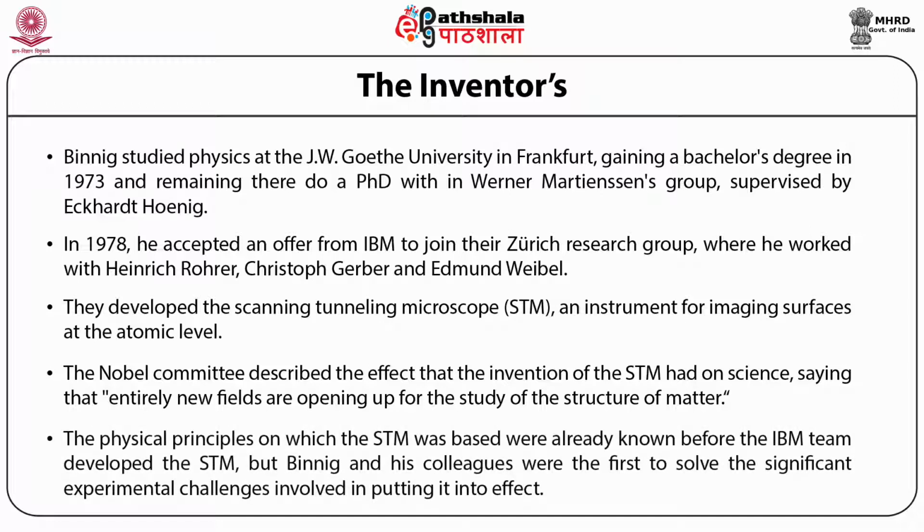The physical principles on which the STM was based were already known before the IBM team developed it. But Binnig and his colleagues were the first to solve the significant experimental challenges involved in putting this into effect. This was a great discovery in the sense that one could go to the atomic level on these surfaces, which otherwise was not possible.